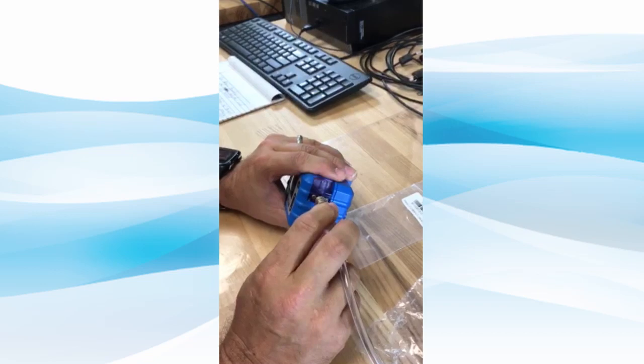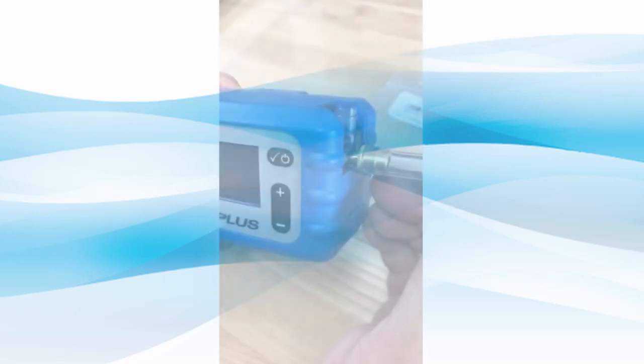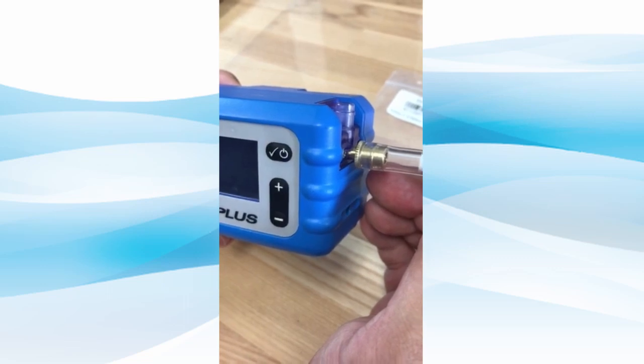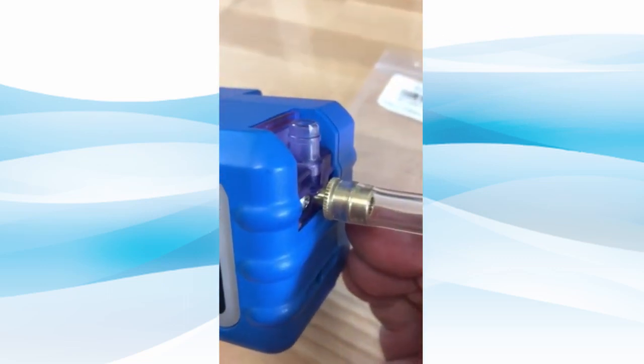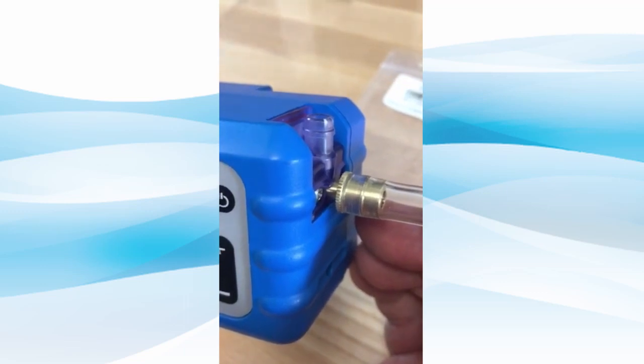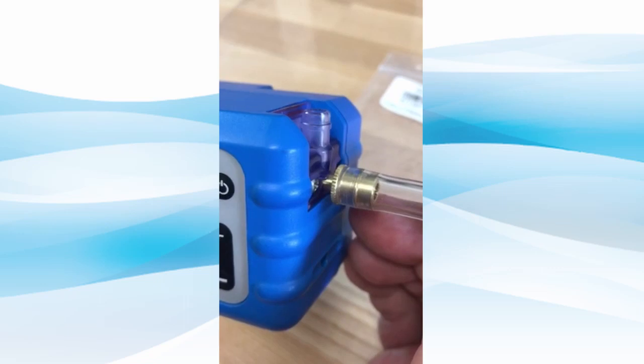The tapered end should not be fully inserted and only needs to be finger tight. You should be able to see some of the copper tapered edge between the inlet block and the flat edge of the knurled portion of the adapter. Attempting to push the adapter in further will damage the inlet block.